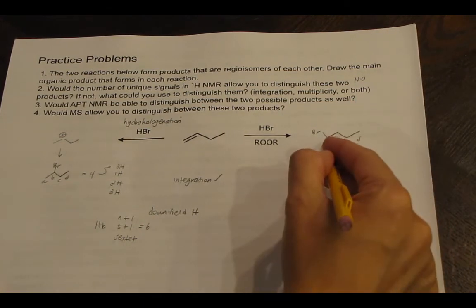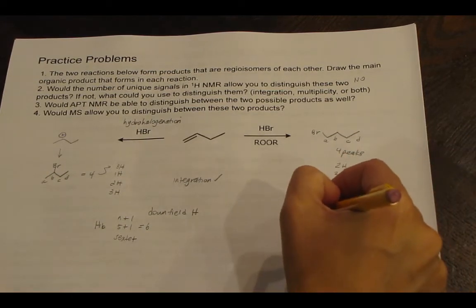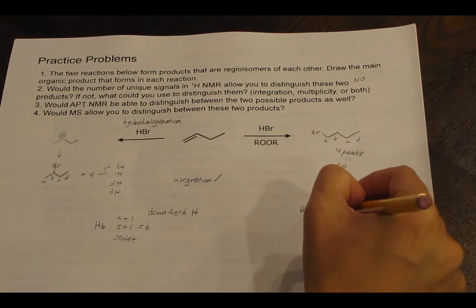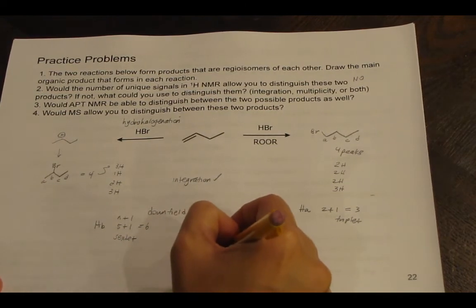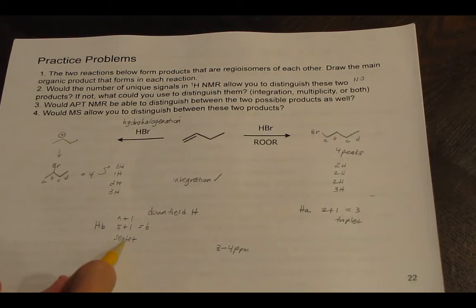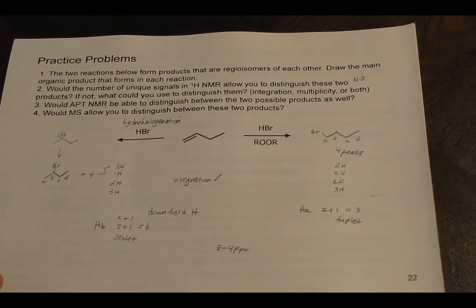What would HA look like in terms of multiplicity? It has HB only as its neighbor. With the n plus 1 rule, it has 2 neighbor HBs, 2 plus 1 is 3, and is a triplet. So you could look at the NMR in the 3 to 4 ppm range, and you're either going to see a sextet if this product's favored, or a triplet if this regioisomer is favored.